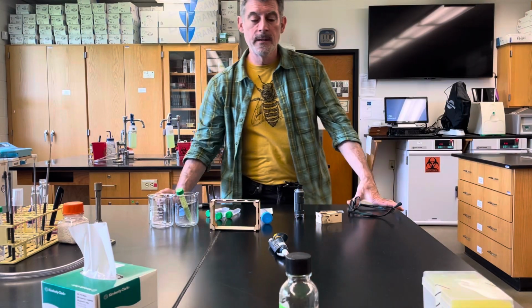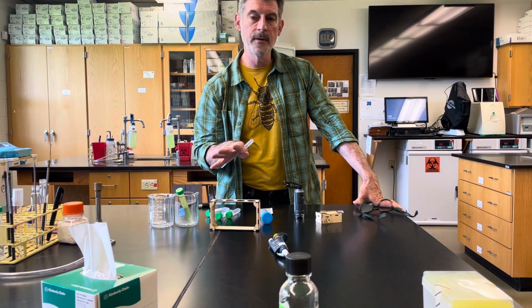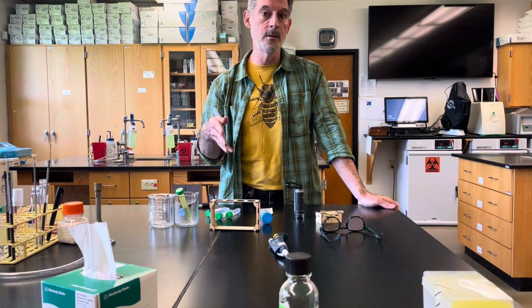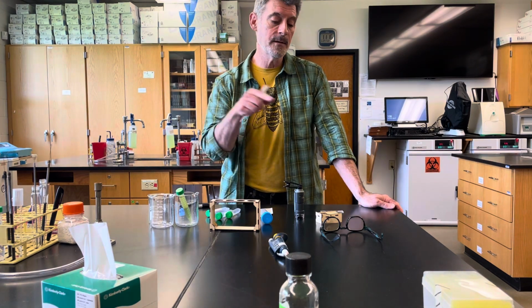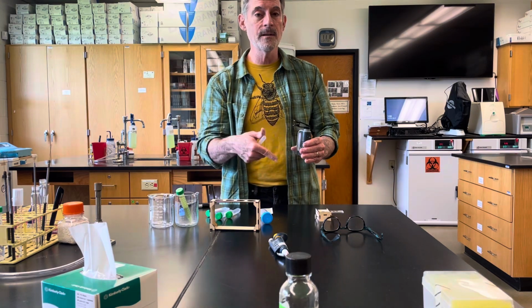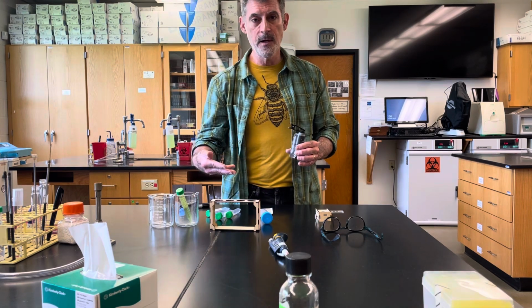Okay, this video is going to be done in two parts. One part is going to be me just talking about the algae experiment, which is slightly different from the earlier one with the core course. So this is the newer one for this summer 2025. And then I'm going to show you the cells under the microscope. So I'll do a second video where I'll just have the cells under the microscope. I'll focus on them. I'll talk about the cells and how you're supposed to count them during the different experiments.